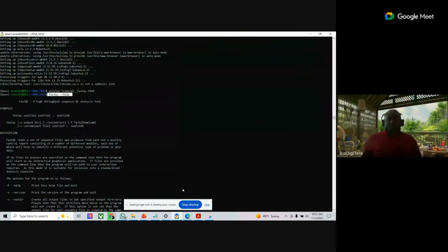When you are ready, let me know. I give you like 5 minutes to do that because it's very basic. Just exactly copy and paste. And don't forget to type version. When you type version, it will confirm if you have installed it already or not.